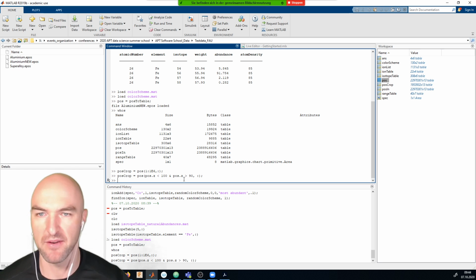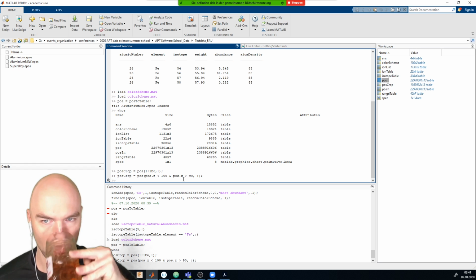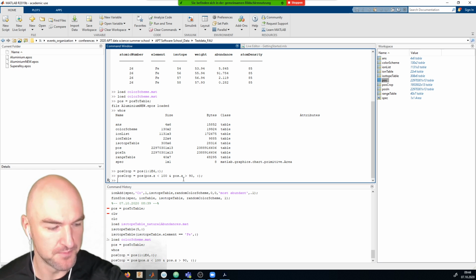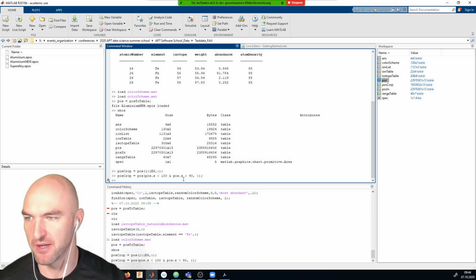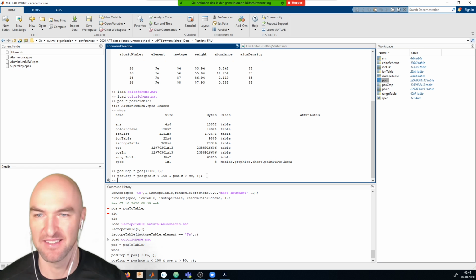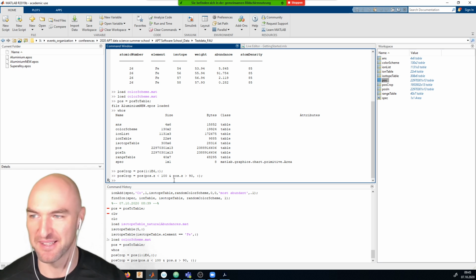And so these are very simple things you can already do just based on the pos variable. And I think we all had situations where we maybe wanted to crop by evaporation sequence or something like that, and that is very simple to do. Thank you, Martina, for putting in my code lines. I've totally forgotten that I was supposed to do that.